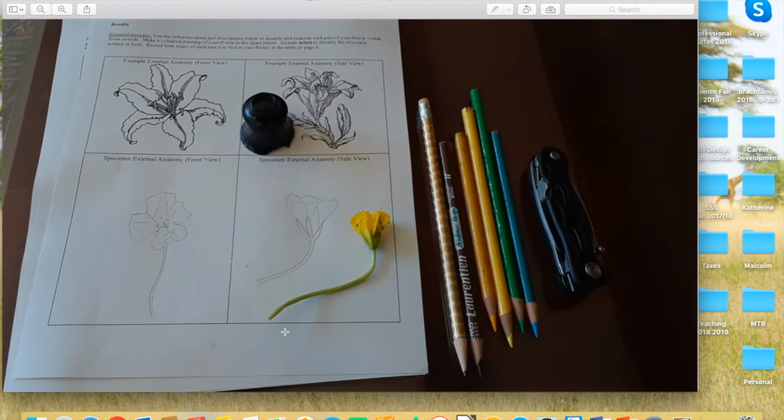I got my colors together and I made some black and white drawings. That's the way I recommend doing this. You know, it's not really up to me if you do the drawings at all with this handout, with this activity. It's not really up for me to tell you how to draw. The only piece of advice I'll give you is if you want to draw something, don't go to it with any kind of preconceptions about what it should look like.